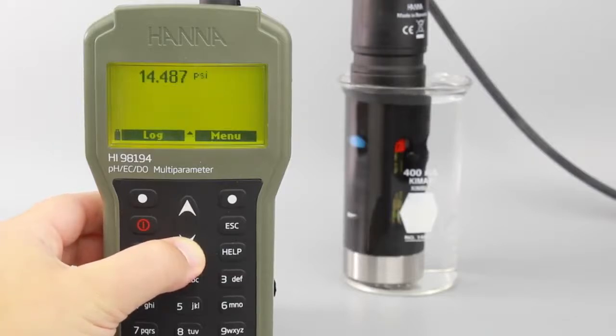So that's it. The Hanna Instruments HI-98194 Multi-Parameter Meter is perfect for field use across many industries. You can find everything you need for your meter at hannainst.com/HI-98194.